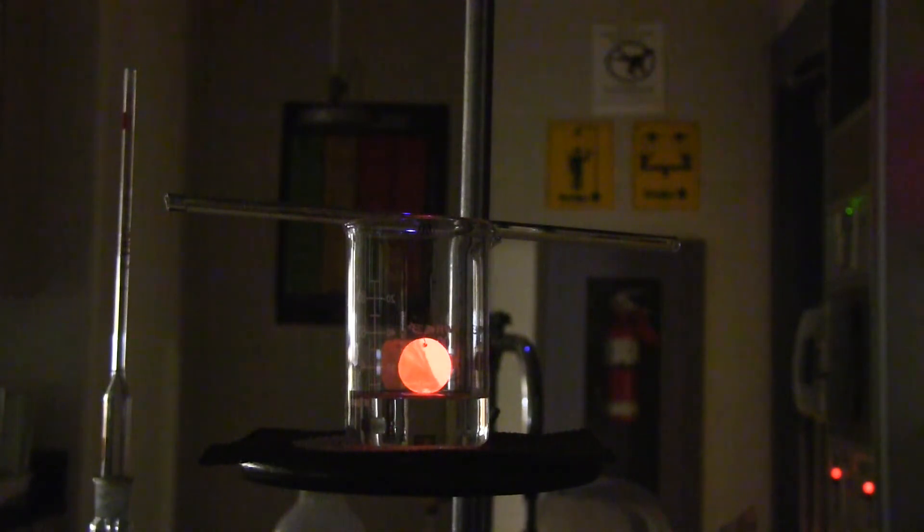Enjoy the red hot glow of the penny. This red colour lasts as long as there is acetone in the beaker. Mind you, the Bunsen burner has been turned off.